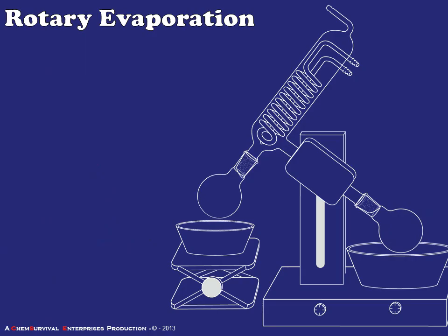Now let's go all the way through this rotary evaporator and identify all of the essential parts and what they do. I'll be referring to the round bottom containing your sample solution as the boiling flask. There's also a rotational unit — basically just a motor that spins the stem of the boiling flask along the axis through the opening. There's also an elevation rail that allows you to slide the entire system up and down to put it into or raise it out of the baths.